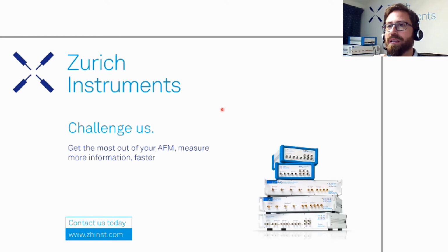I don't think I have the answer right away. Clearly, if you have a smaller amplitude, as we could see from the slide, where there was a paper from Tino Wagner, the smaller the amplitude, the higher the resolution and the contribution you get from the apex. So the closer you should be to the real CPD. But I don't have a better quantitative argument at this stage. Hopefully we can come back with more questions.